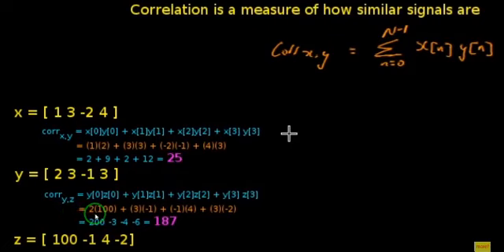So there must be a problem, because this number is bigger than 25. So does it really show that these two curves are behaving more similarly or not? Well, as we saw, for sure they are not behaving similarly, but x and y were more similar.